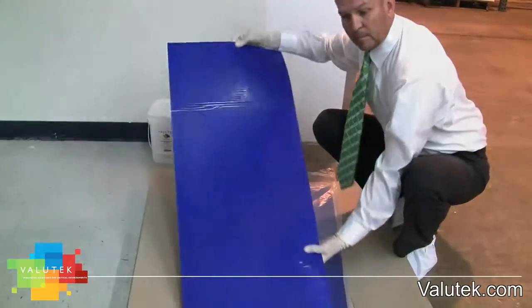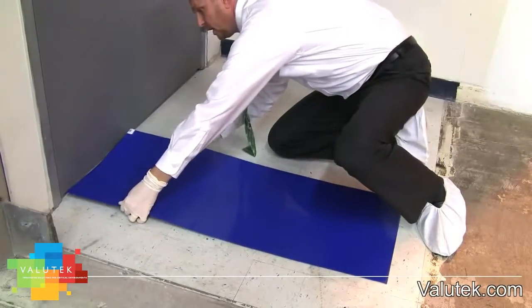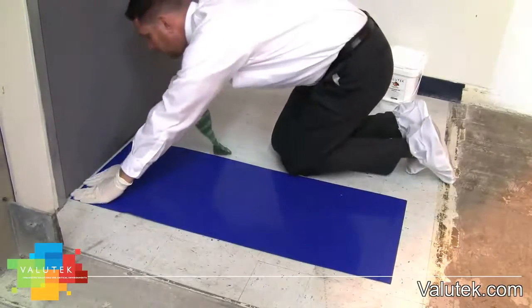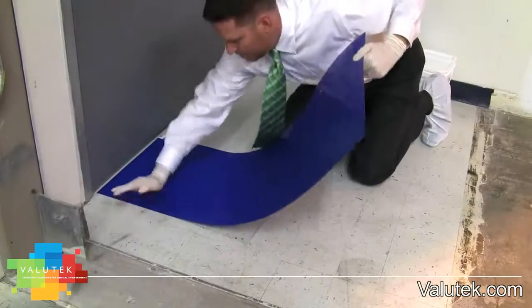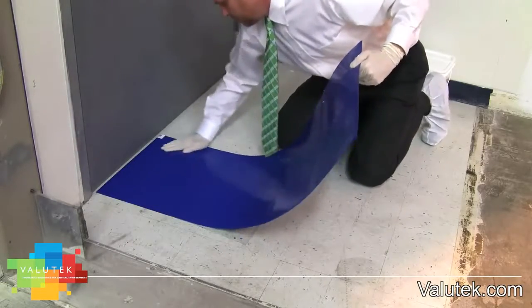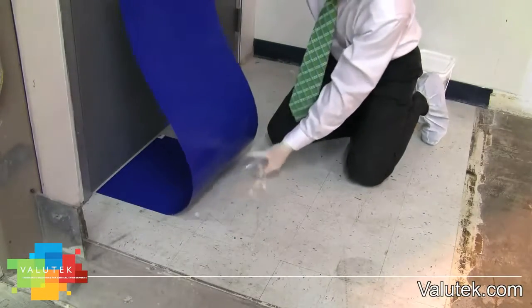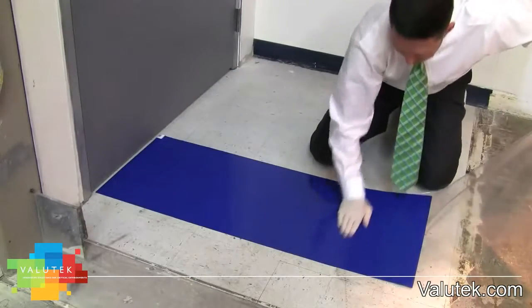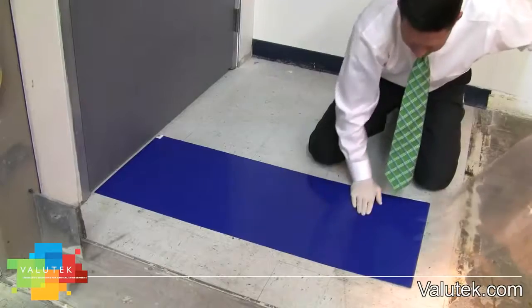So Mike, do you think we're ready to place the mat on the floor? Let's start by pulling back the backing of the mat six inches, then firmly press the exposed area to the floor, starting in the middle and working outward towards the edges. This helps remove bubbles and veins that may form as you are placing. Pull back another six inches and press outward, repeating the process until the entire mat is adhered to the floor.